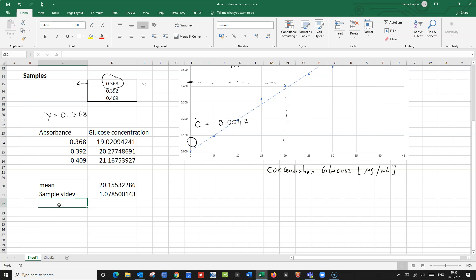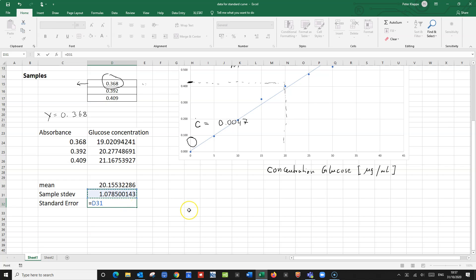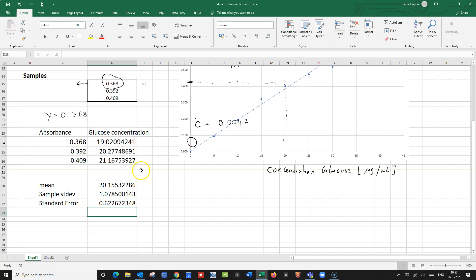And we can calculate the standard error. We know that we do this by calculating the standard deviation divided by the square root of the number of observations. Here we've got three observations, so it would be the standard deviation divided by the square root of three. And we would get a standard error of 0.62.